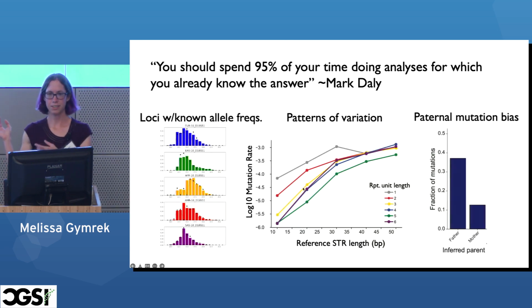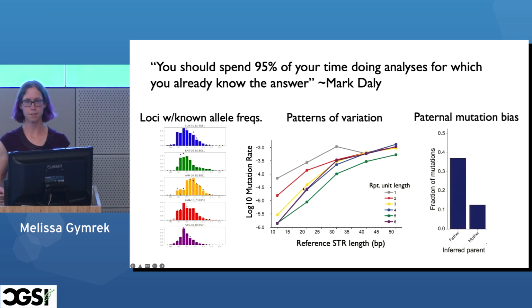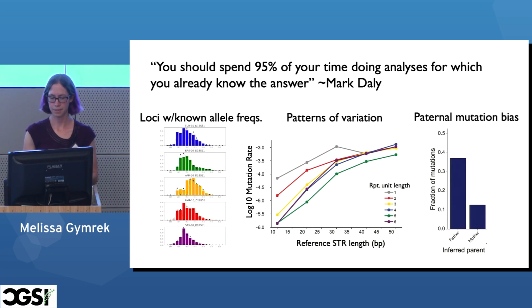If we were looking at mutations, we know that there should be more mutations generally from fathers than from mothers. So do we see that in the data set that we were given? All of these types of analyses, if we don't do any filtering, don't look great. But after you filter the data and get rid of the low quality calls, then these known trends start to appear. So this is a really important part of the analysis pipeline whenever you're doing anything with big data sets.